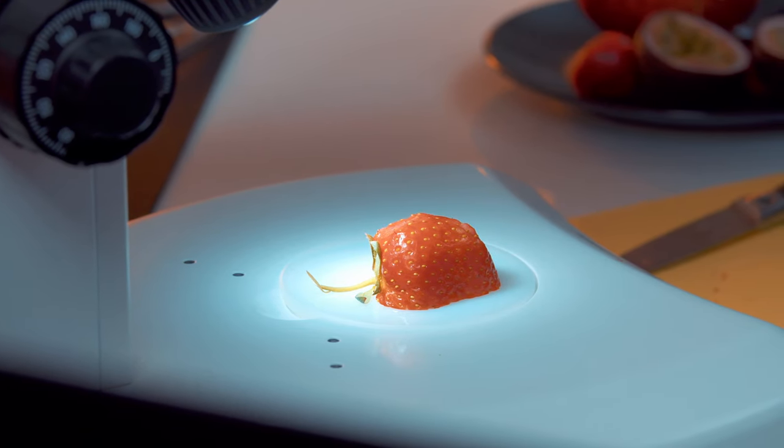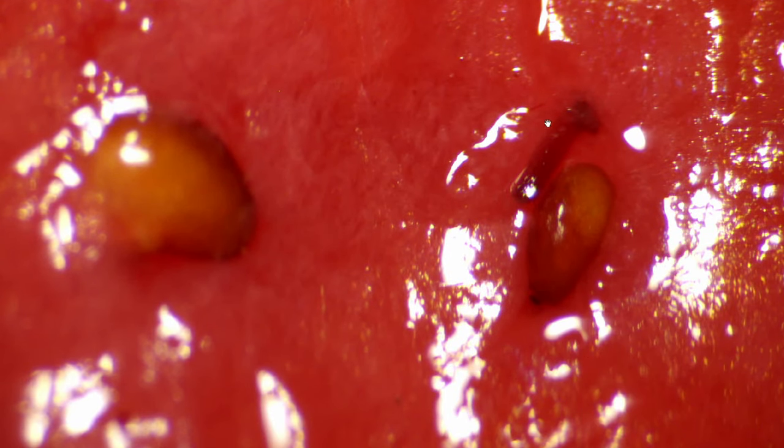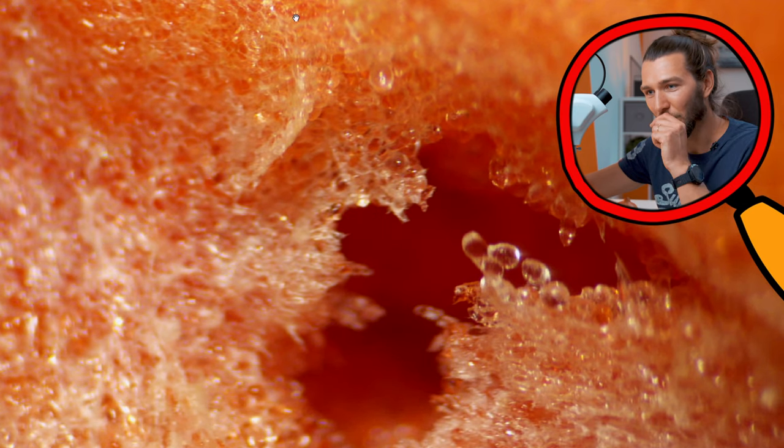It's passion fruit — not a slug, lucky me! So we're on the outer skin of the strawberry now. It hasn't been washed at all so it's quite dirty. The skin has been damaged a bit because it's a bit aged — not quite rotten yet, just a bit aged. You can see the seeds here and some whiskers standing out, similar to the raspberry and the blackberry. Now let's turn it around to the center — it's a bit more open and lighthearted. Zooming in, it looks like a lot of small pebbles just sticking next to each other — not strings, but small pebbles. It's so cool!